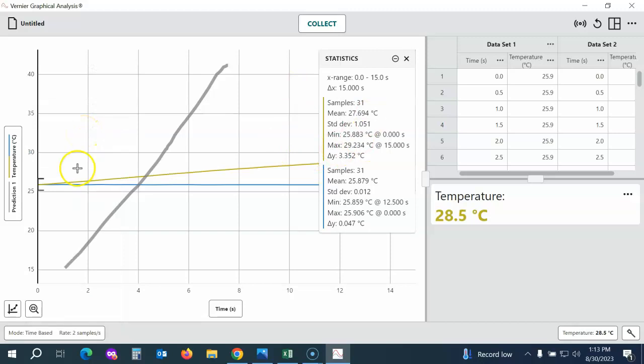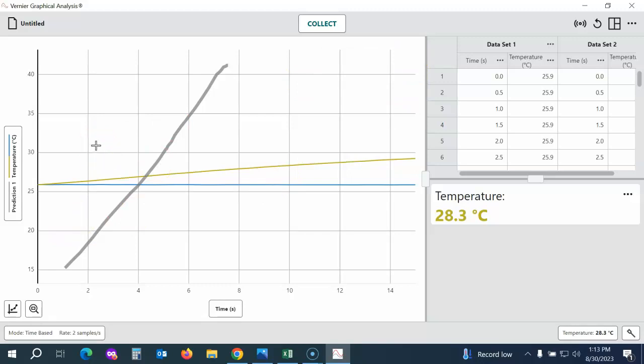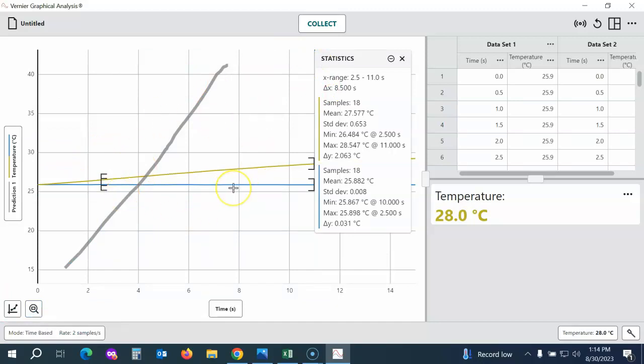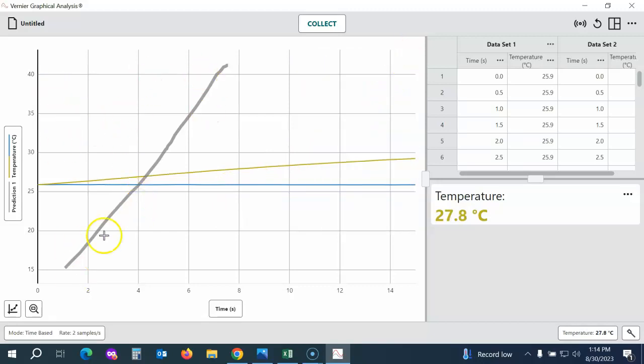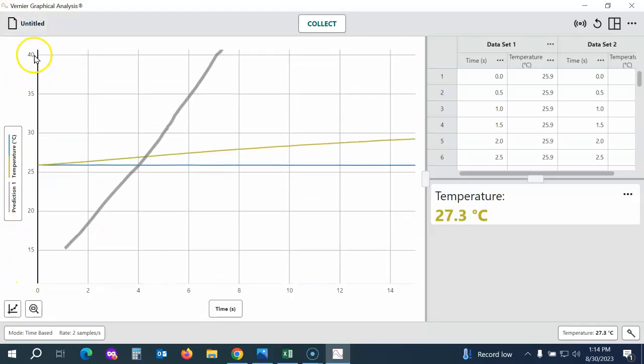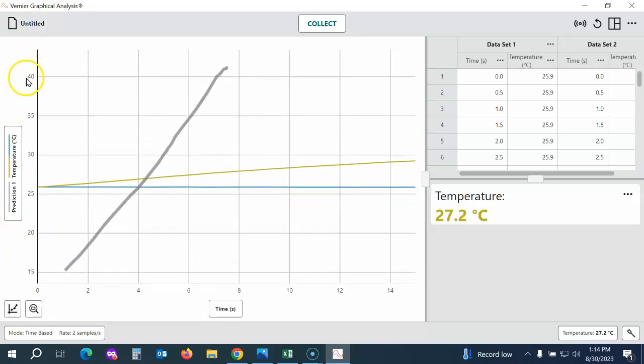We'll go ahead and view the statistics — this gives me statistics for the full data set. If I only want to analyze part of my line, I can click and drag to highlight a section and then go to Graph Options; it will only analyze the highlighted section. If you want to zoom your graph, use the Zoom to All Data button to fit the collected data. To scroll up or down, take your mouse cursor to the y-axis area, hold the mouse button down, and slide up or down.